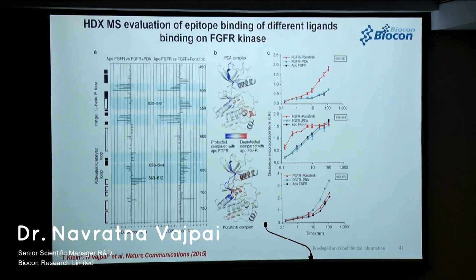Of course there I also had the NMR assignment, but I had 1.5 years just to do that. So we did NMR assignments, and then we wanted to cross-check whether everything matches closely with HDX-MS. We looked at it, and the information content was exactly the same in NMR and in HDX-MS. But what I wanted to show here is some of the uptakes. The uptake was clearly distinct for the 2 different ligands. You clearly see the red and blue, and at times they were also very similar.